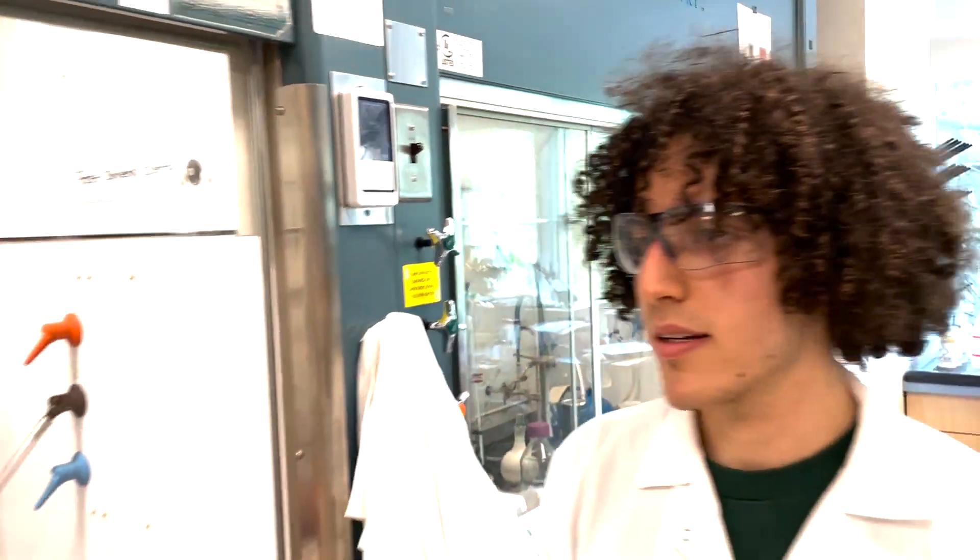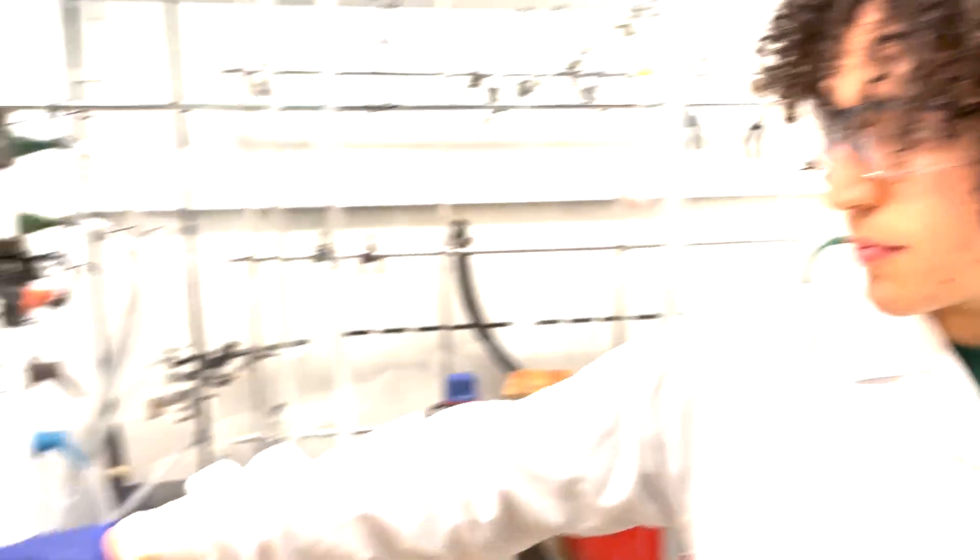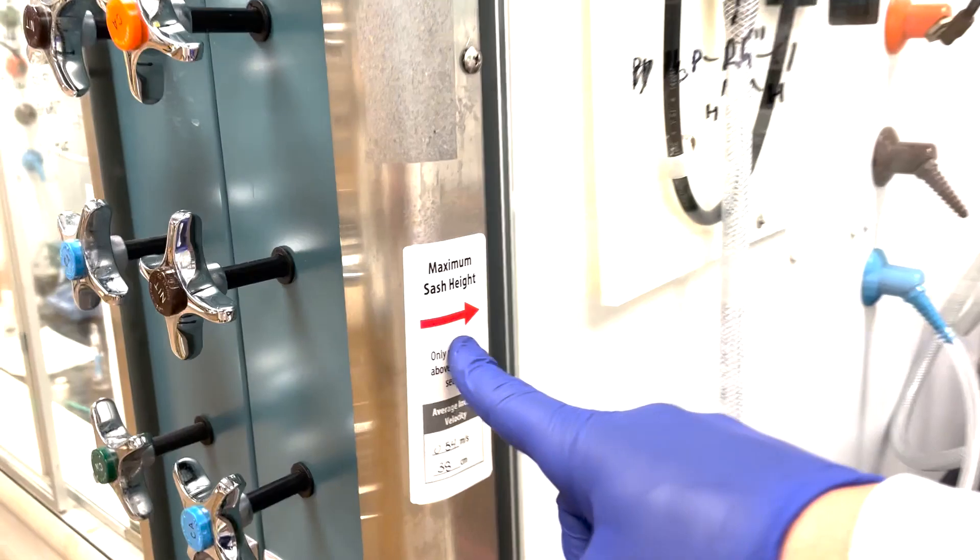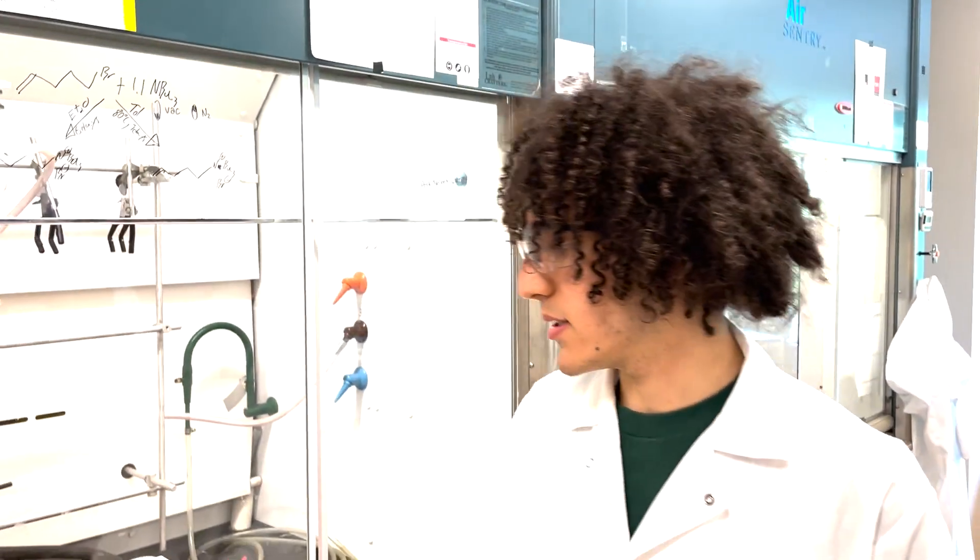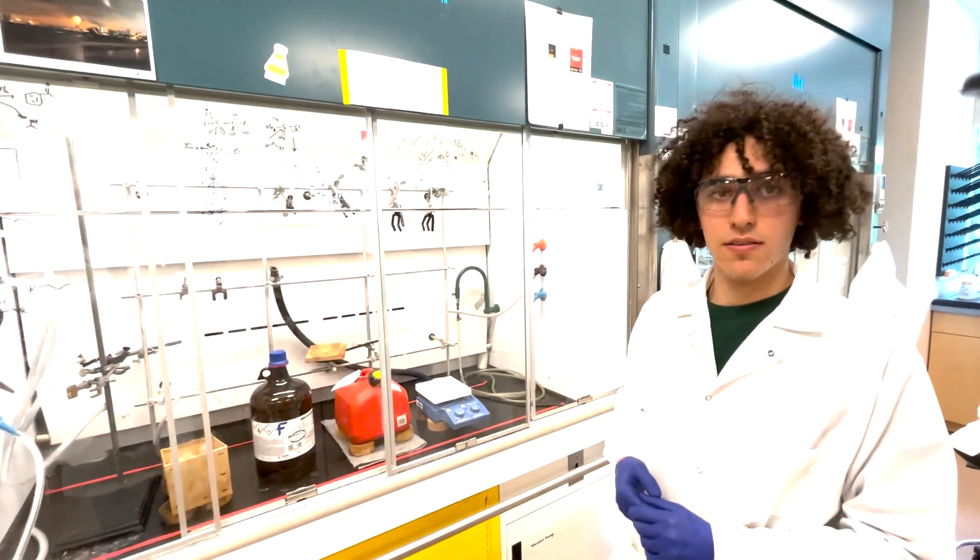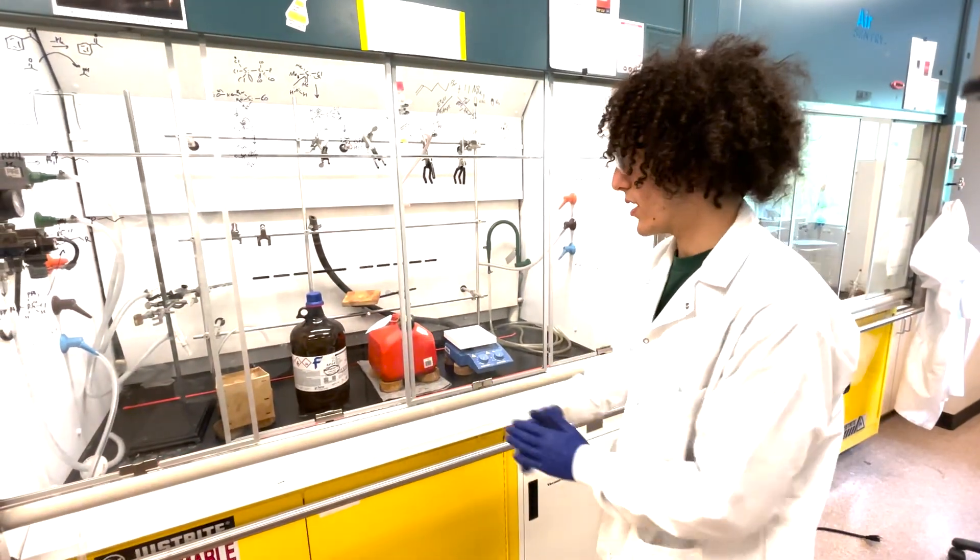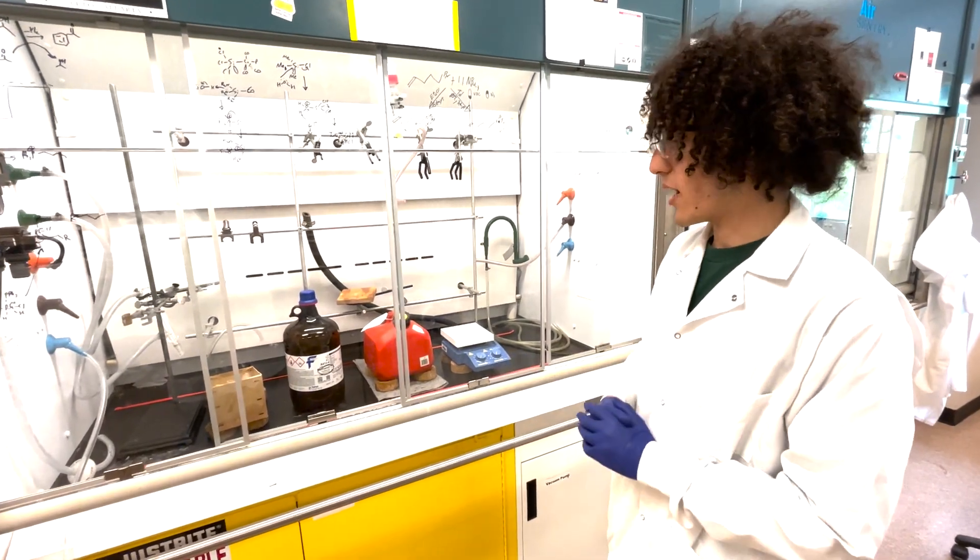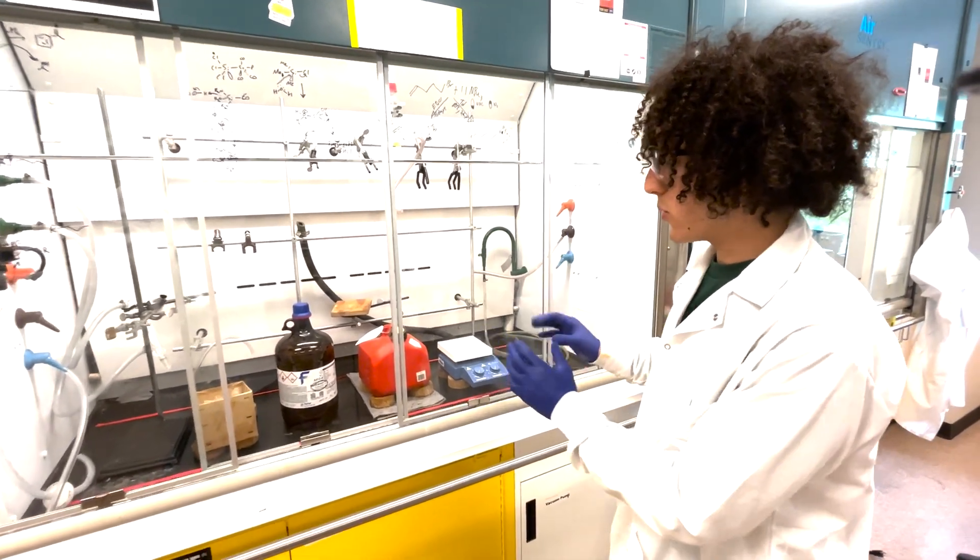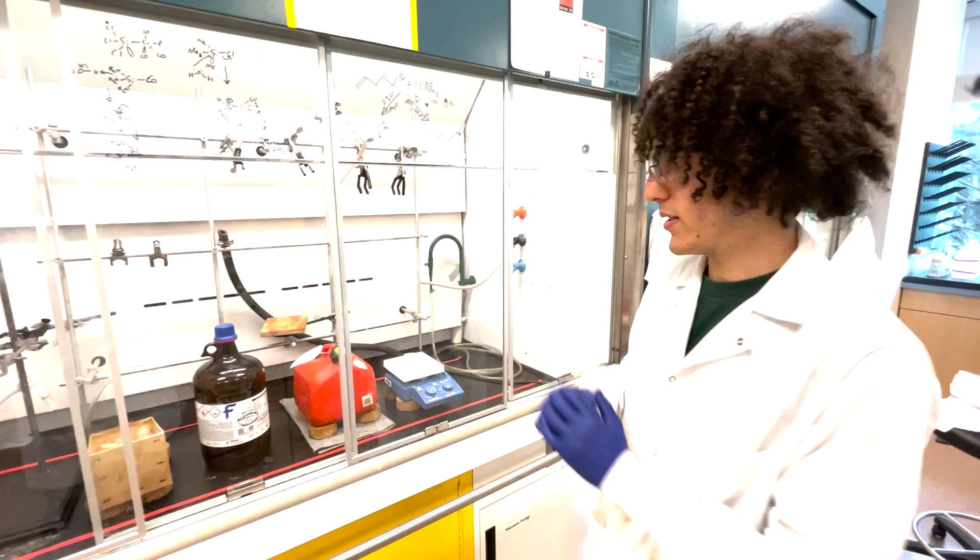When fume hoods are validated, they are indicated with a maximum sash height shown by this arrow. Maximum sash heights are important because the height of the sash impacts the effectiveness of the inward flow of air, or recapturing velocity, and this relates to how well the fume hood controls fumes on the inside of the enclosure.